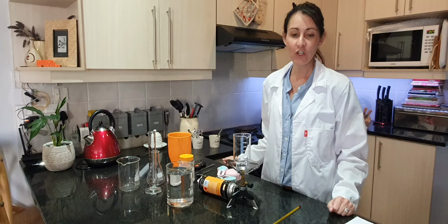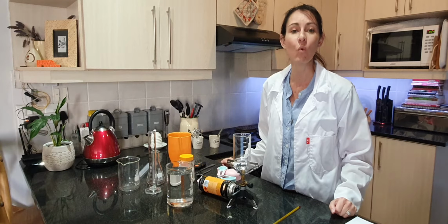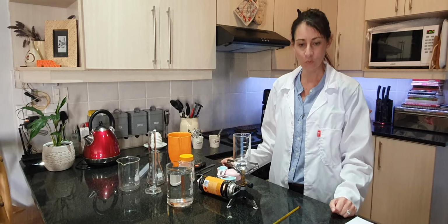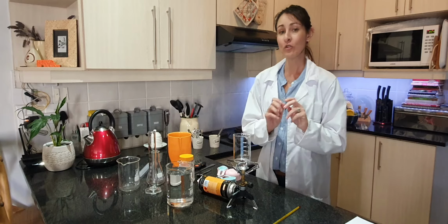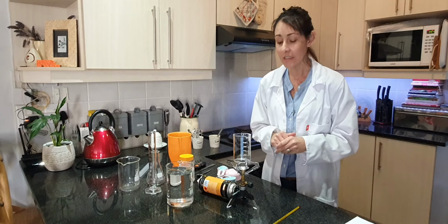Today we have to do a practical, and the aim of your practical investigation, I've got it on my computer. It says to compare the boiling point of water and salt water. So I'm going to walk you through the chemicals and the ingredients and things that we need.